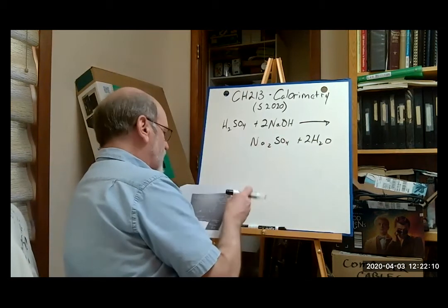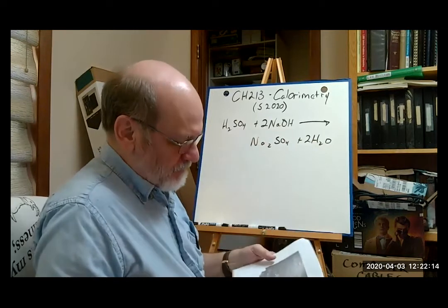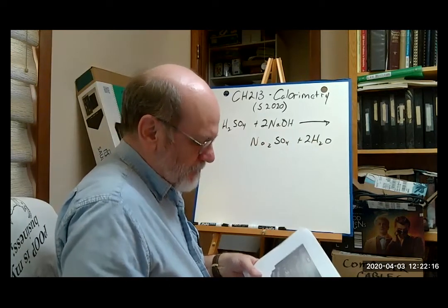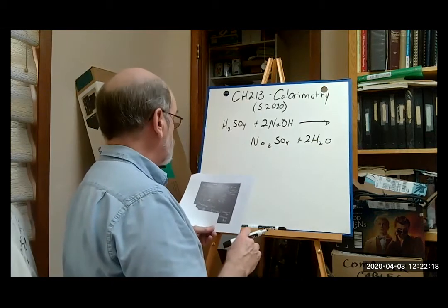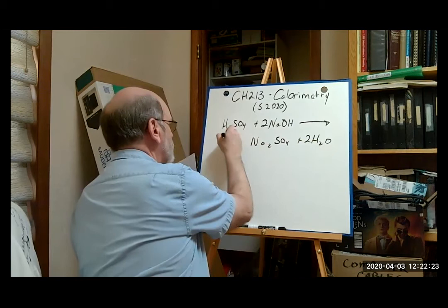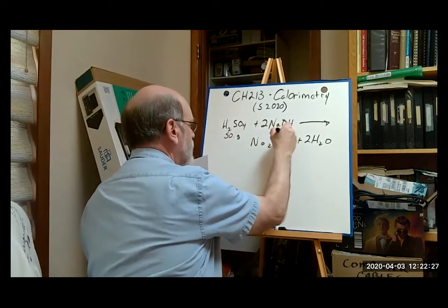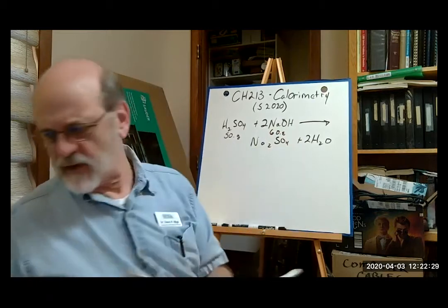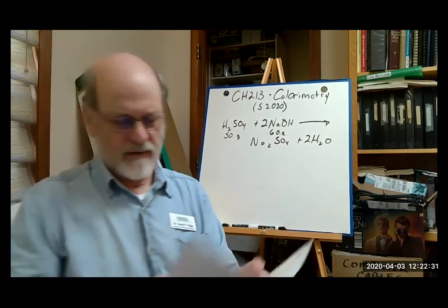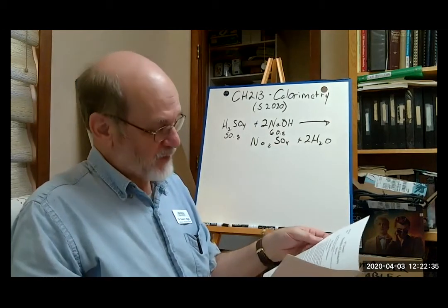So when you set this up and you gather your data, you're going to take 50 grams of acid and 60 grams of base. Let me be sure.